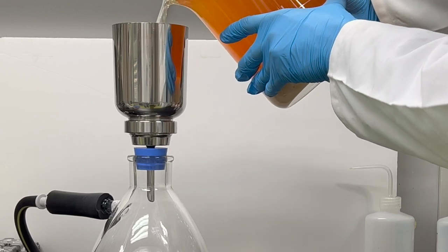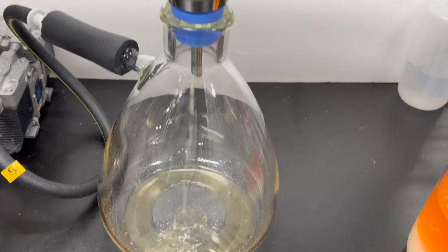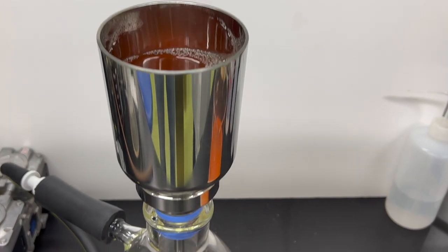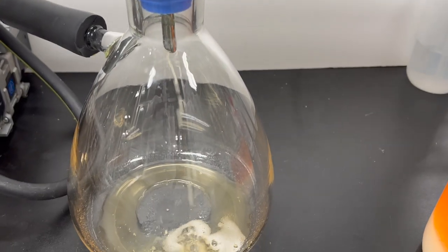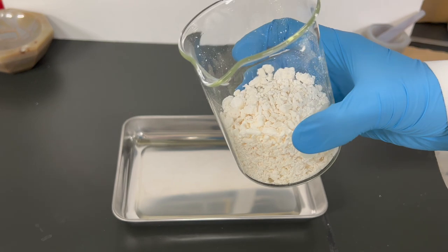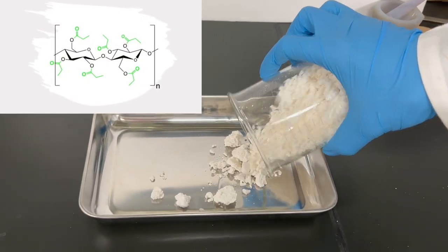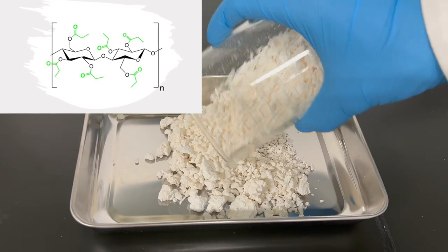Next step is vacuum filtration. After drying under vacuum at 50 degrees Celsius for 16 hours, we obtain the final product: cellulose propionate.